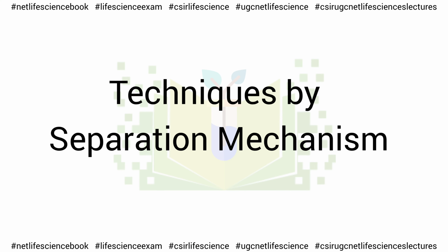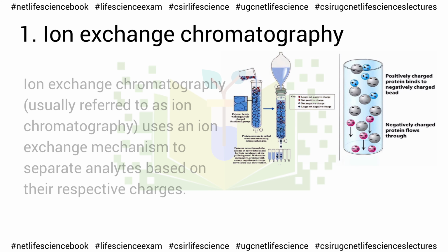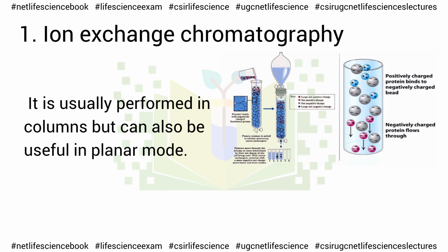Techniques by separation mechanism. Ion exchange chromatography. Ion exchange chromatography uses an ion exchange mechanism to separate analytes based on their respective charges. It is usually performed in columns but can also be useful in planar mode.